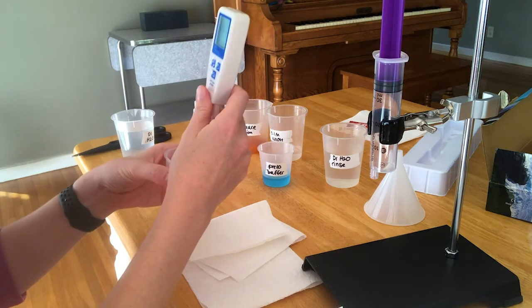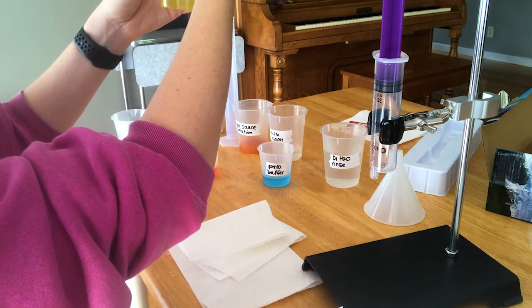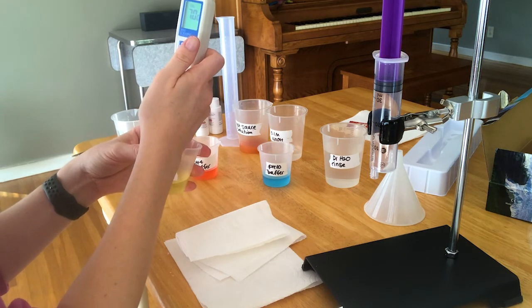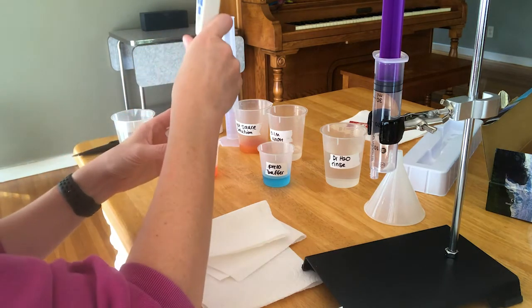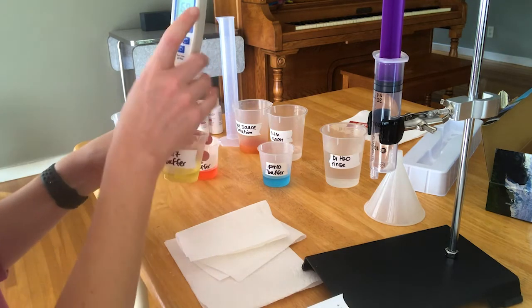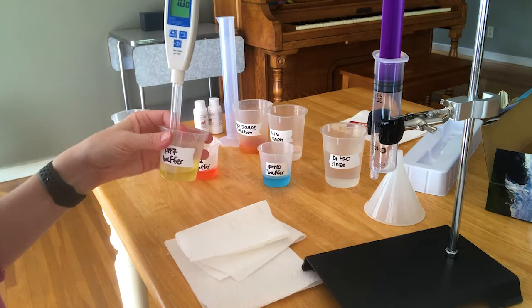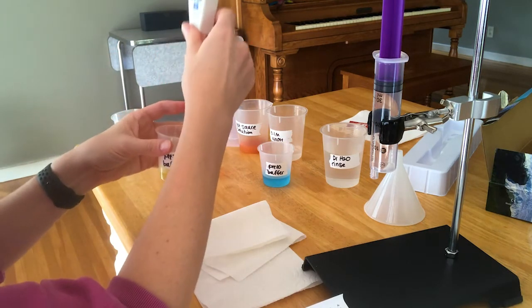First start out with the pH 7 buffer. Make sure that the glass bulb is totally immersed under the solution, even if you have to tilt the beaker. Then press the calibrate button — it's going to recognize that you're looking at a pH 7 buffer and say 7 on the face. You're supposed to wait until you get the message SA, and then it will say end when it's done. So press the calibrate button, it'll say 7, and then just be patient. When it says SA and then end, you're okay to take it out.